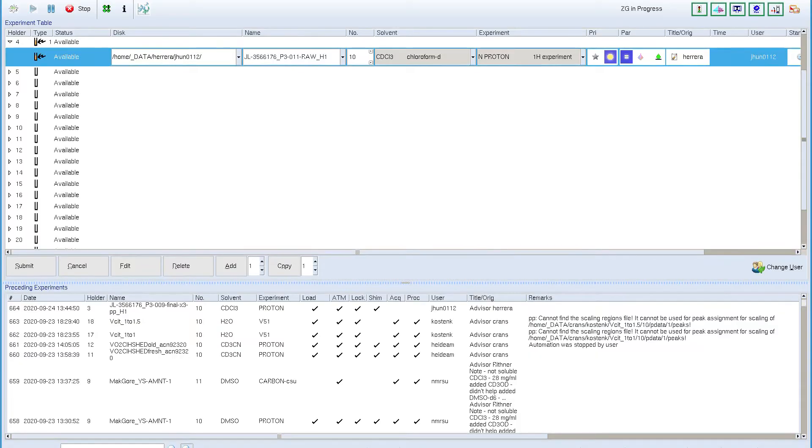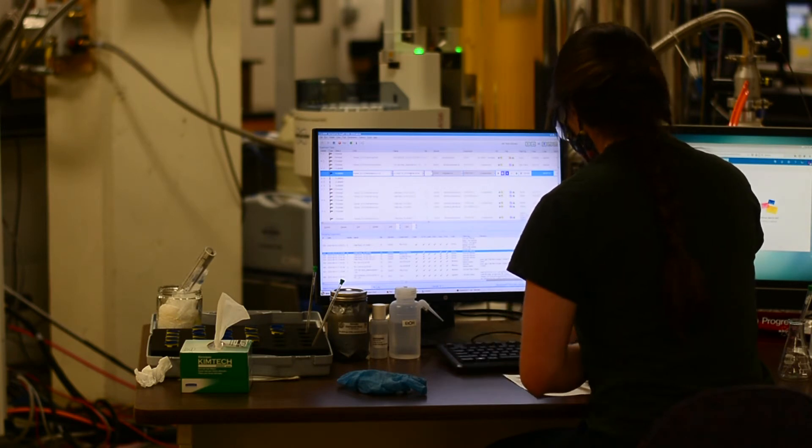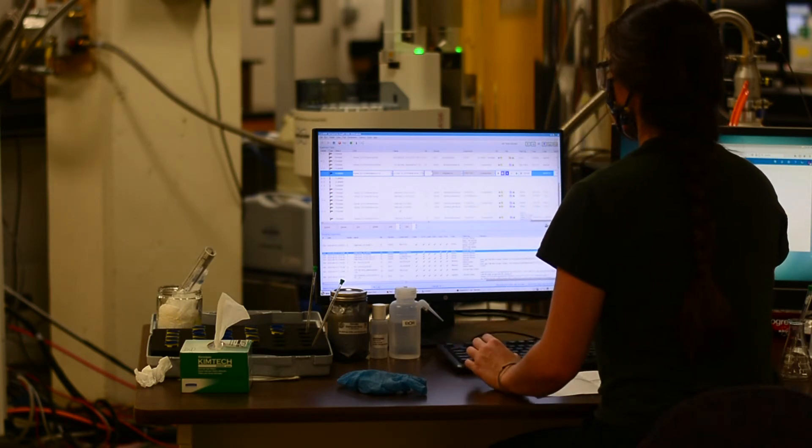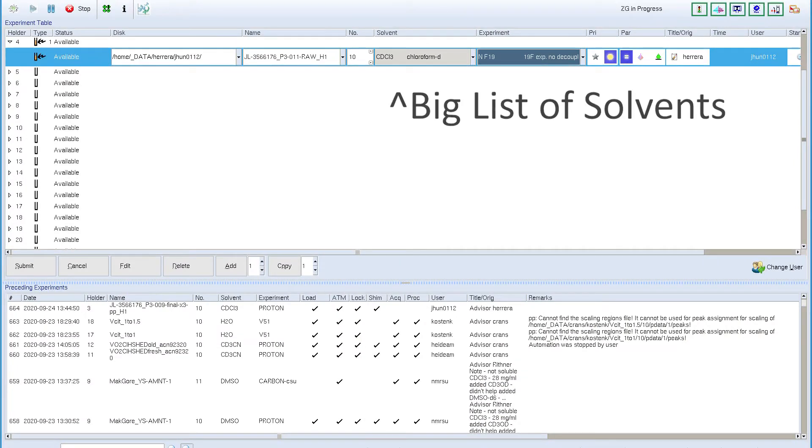Name your sample something that makes sense to you, avoiding special characters. Use only numbers, letters, dashes, and underscores. The experiment number field will automatically populate, so you can move on to the solvent and select your solvent from the list in the drop down.